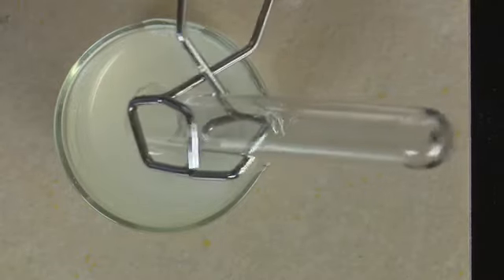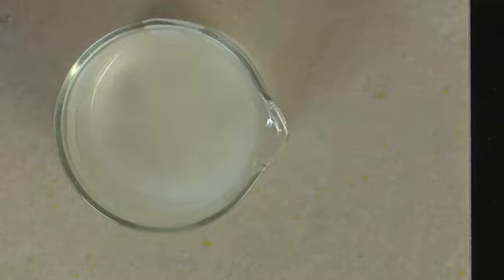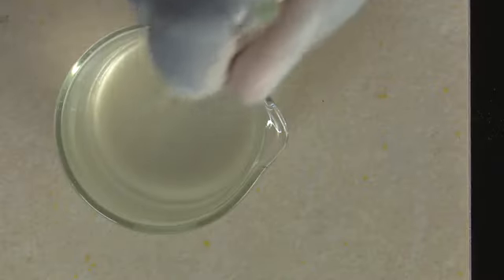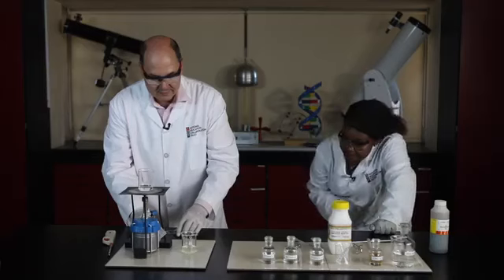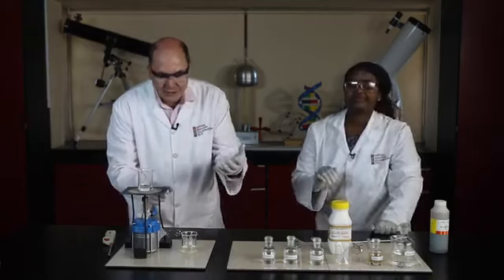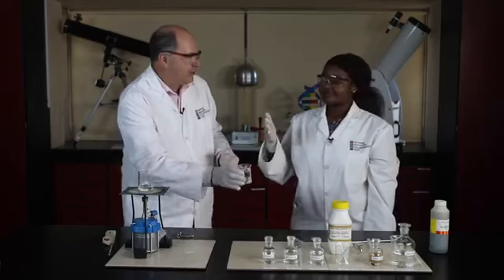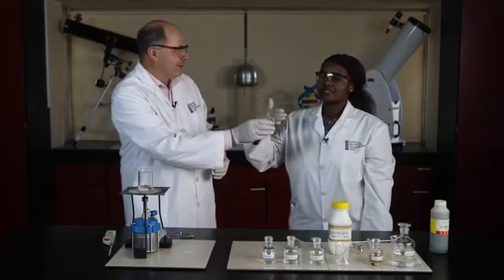Oh, isn't that great? Right. Let's stir a bit. No, Joyce, there's no need to let it stand for a short while. I can smell something. Wow. Have a waft. What fragrance? This ester has a very distinctive smell.